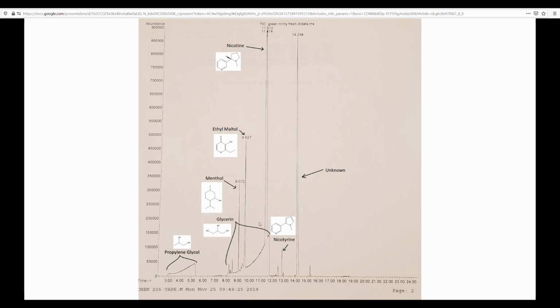You'll run into this a lot when you run biological compounds or technical grade food products, which are not entirely pure. This is why you get a lot of these mess of peaks. This brings us to this unknown. It's obviously a major component of the spectra, and the problem here is that the computer, despite the peak being so pronounced, was unable to determine it at all with any significant clarity in its library searches.